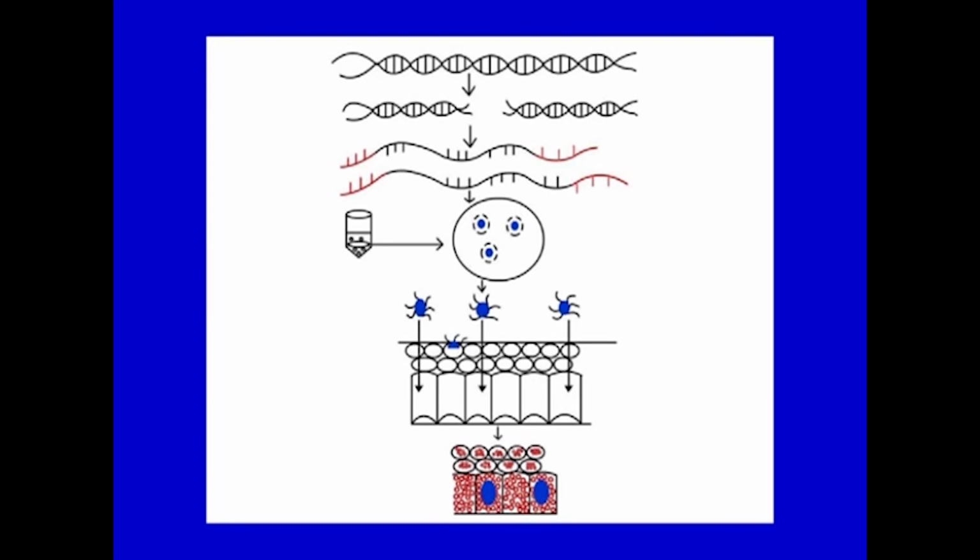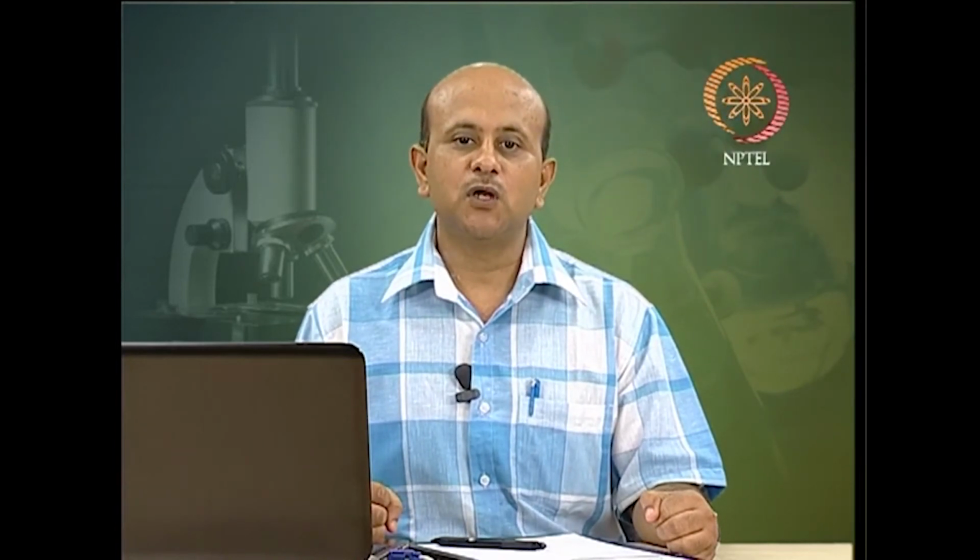The DNA on each of these beads is sequenced using a series of coupled enzymatic reactions, and these are collectively known as pyrosequencing. So, in pyrosequencing, a solution containing only one of the 4 dNTPs is flowed over the bead containing slide. Now, if that dNTP is complementary to the first unpaired base on a template strand, DNA polymerase catalyzes its addition to the primer strand and releases pyrophosphate ion.